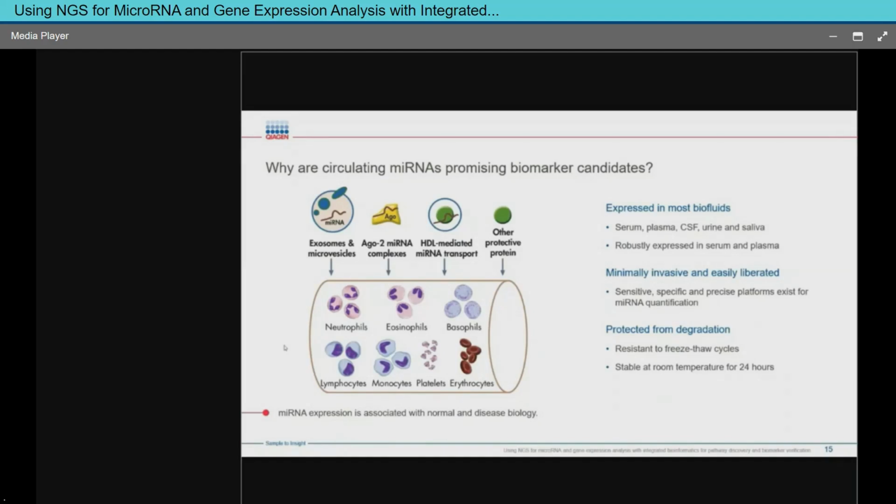And if we identify hemolytic markers, we know that these samples are going to behave probably a little bit differently than ones in which we don't identify. It doesn't mean that the samples are bad. It just means that we have to understand that when we put the data together, these samples with the hemolytic markers may have bled microRNAs that are cellular and not necessarily things that are in circulation.